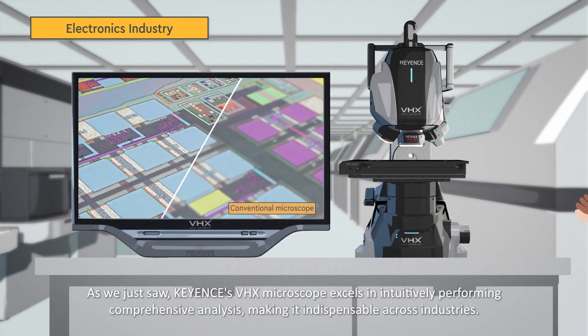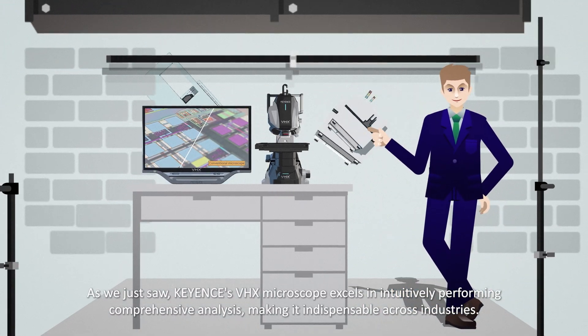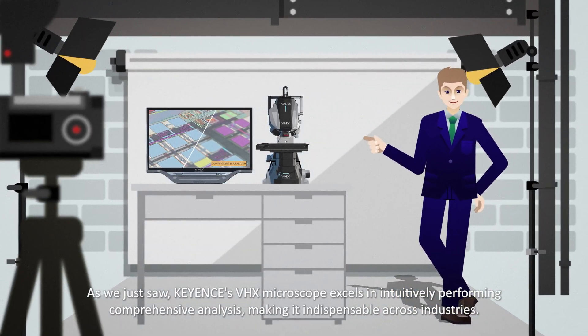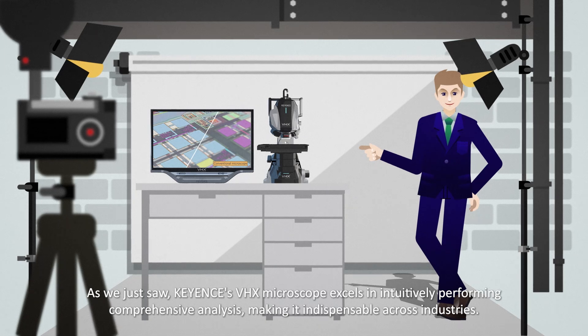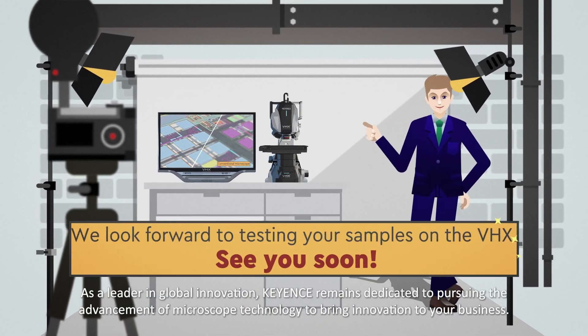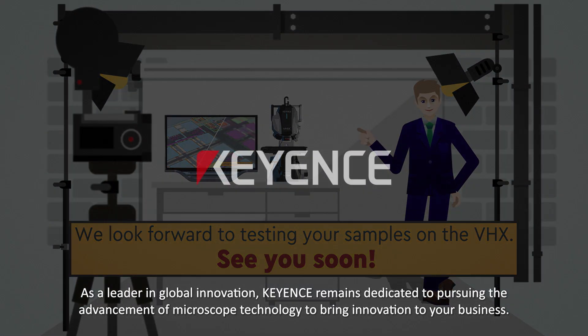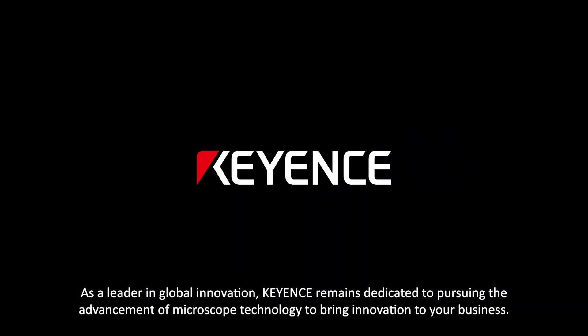So what are your thoughts? As we just saw, Keyence's VHX microscope excels in intuitively performing comprehensive analysis, making it indispensable across industries. As a leader in global innovation, Keyence remains dedicated to pursuing the advancement of microscope technology to bring innovation to your business.